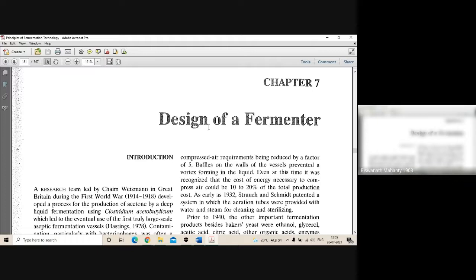In today's class, we will be focusing not only on that, we will also talk about how to carry out the operation in a fermentation process. And it all depends on very important things. It depends on what microorganism you are dealing with, and how many precautions we should take. Because when you are doing laboratory work using your microorganism, when I am injecting the inoculum, there is a lot of possibility that the microorganism may come out. Or the exhaust gas going out of the fermenter, because you are continuously supplying oxygen, right? There is a possibility of the exhaust gas also carrying some contaminants.